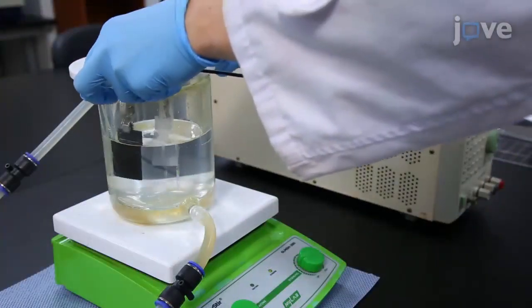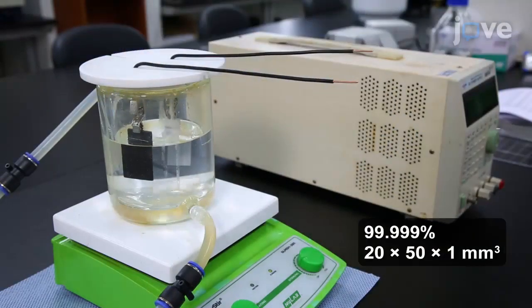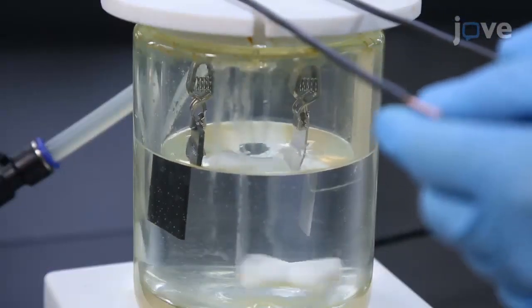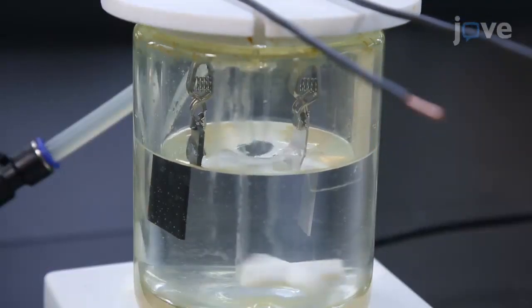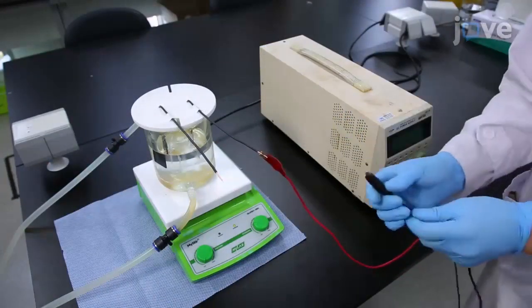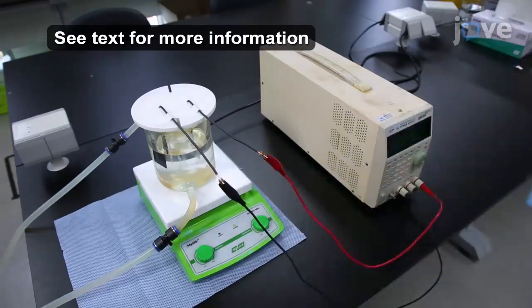Immerse the ultra-pure aluminum plate and carbon counter electrode into the electropolishing solution using crocodile clips and copper wire. Adjust the position of the aluminum plate and the carbon counter electrode to face each other. Connect the aluminum plate to the positive terminal and connect the carbon counter electrode to the negative terminal of a direct current power supply.